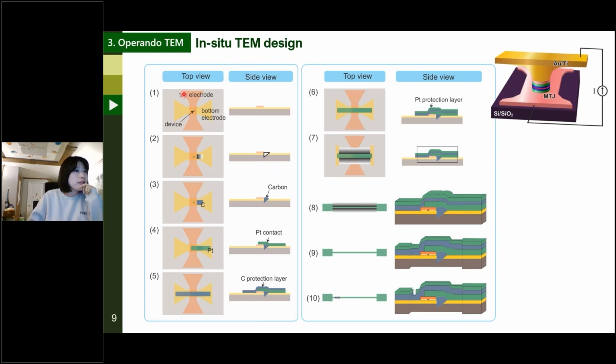First, we have to find, identify, and position the region of interest. We check the SEM image, and then we locate the center nanopillar. Because the nanopillar is very small, we should be careful not to coat the sample too much, because it will become unidentifiable.